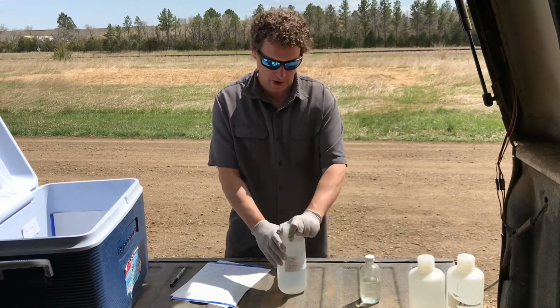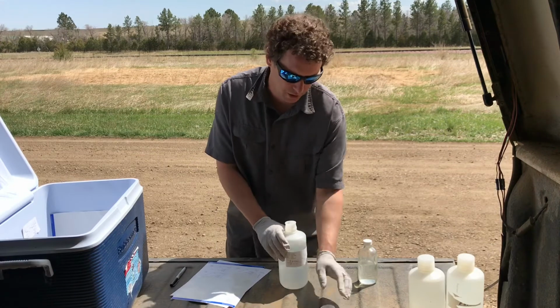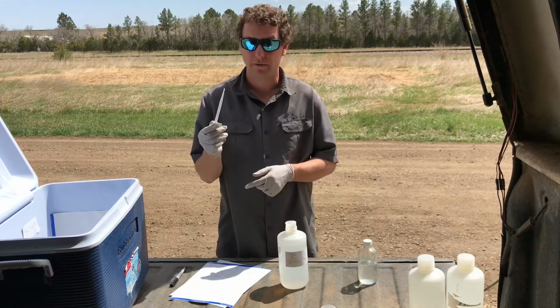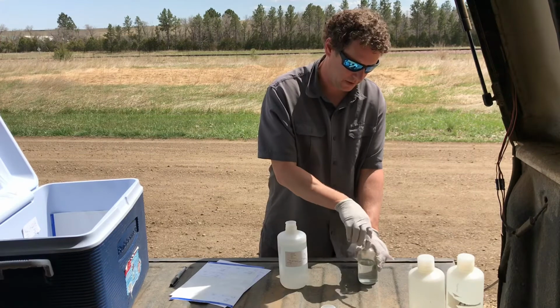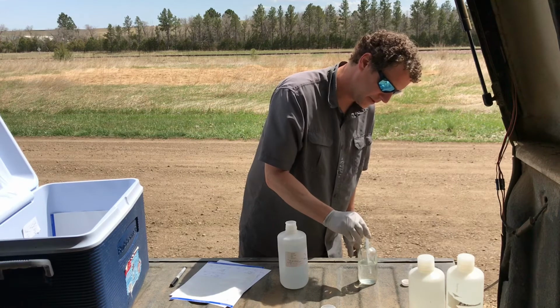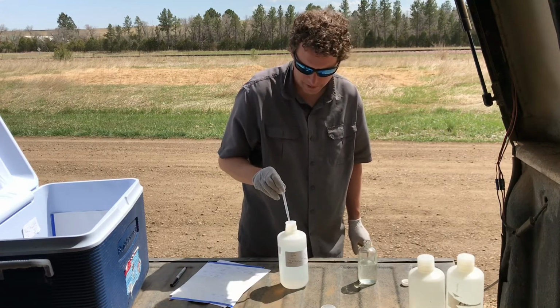Now, to preserve our B bottle, we want to be very careful. This is the most dangerous part. I always open my acid bottle last, and I close it first. So we want to use a clean pipette. Get a fresh one out of your bag every time. Very carefully open your acid bottle and set the cap aside and measure out 2 milliliters of sulfuric acid. Very carefully drop that into your bottle.